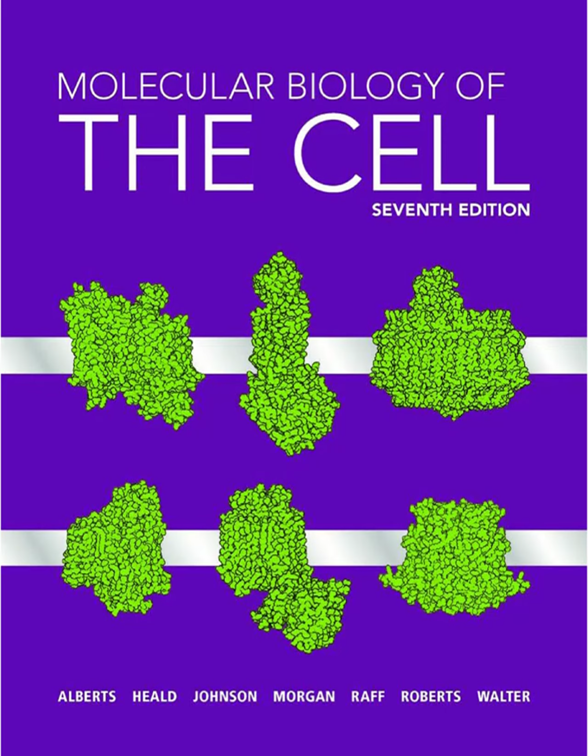Light sheet, how does that work? Instead of shining a focused beam through the objective lens, you use a separate cylindrical lens to create a thin sheet of light that illuminates the sample from the side, perpendicular to the detection objective. So you only illuminate the single plane you're currently imaging. Exactly. The detection objective looks at that illuminated plane. This has major advantages. First, you only excite fluorescence in the focal plane, dramatically reducing out-of-focus blur and improving contrast. Second, and crucially for live imaging, you expose the rest of the sample to much less light, minimizing photobleaching and photo damage. So it's faster and gentler.